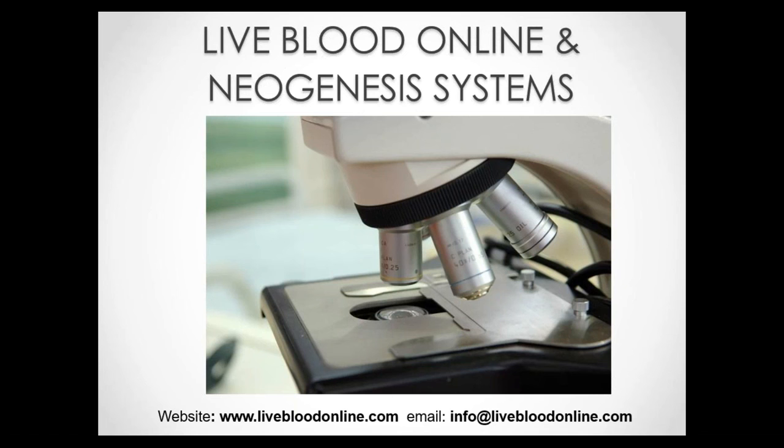And then somewhat related to the previous point, the third point is that live blood analysis allows you to monitor the efficacy of any given treatment. Because we're able to observe changes taking place in the body's internal environment, or the terrain, in real time, we can very easily monitor and track the patient's progress during treatment. By assessing the changes taking place after implementing specific treatment protocols, we can establish whether a specific treatment protocol is actually working or not, and we can then make the necessary adjustments at a much earlier stage than what would have been possible without blood analysis.